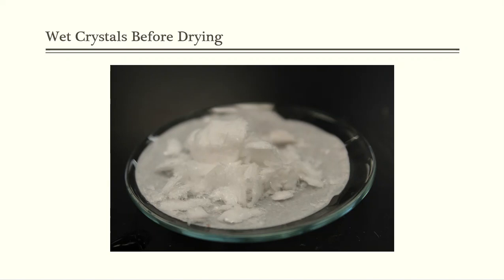And this really is what benzoic acid is supposed to look like if it is pure. So the recrystallization process kind of worked for me at this point. I knew that it did just by physically looking at these crystals. I can automatically tell it. But these crystals are still wet, right? There's still some water residue that's going to be left behind, and I need to dry these out as much as possible.